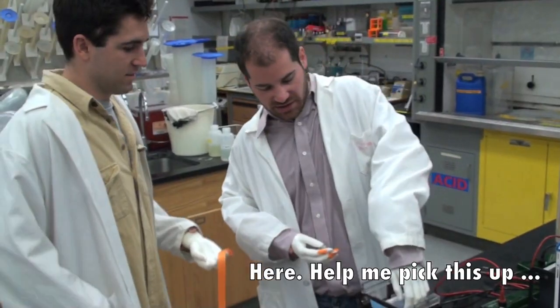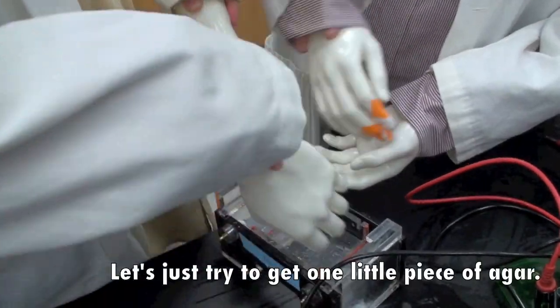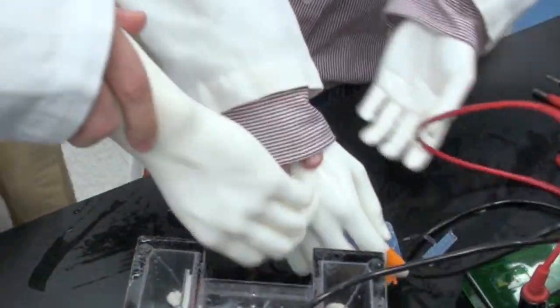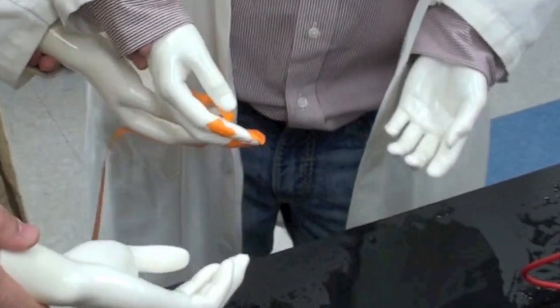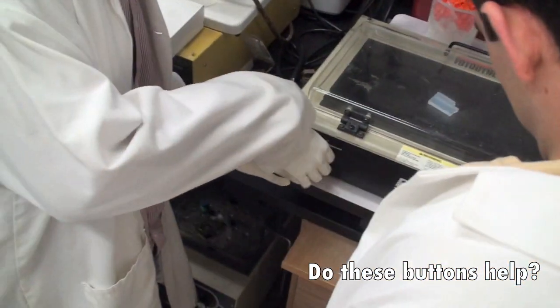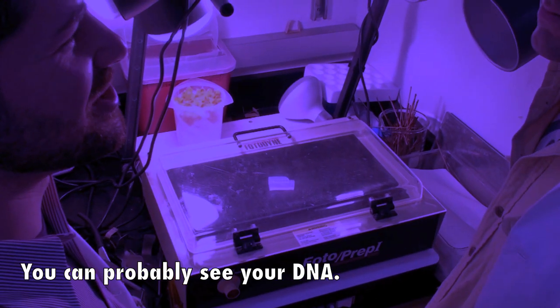Here, help me pick this up out of there. Here, just turn it over into my hand. Let's try to get like one little piece of agar. Perfect. I like it. Just perfect. Just turn this. I don't know, maybe do these buttons help? Yeah, UV. You can probably see your DNA.